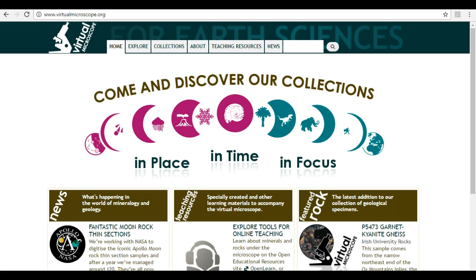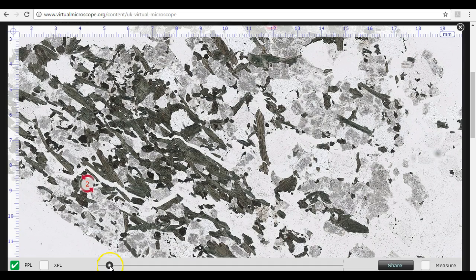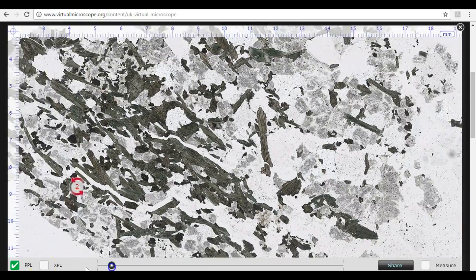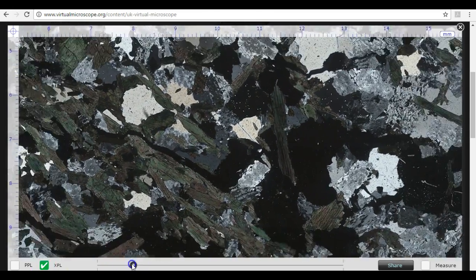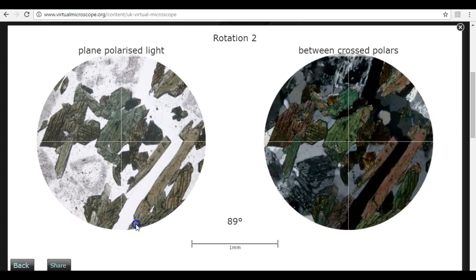The Virtual Microscope has been developed as a platform for geoscience academics to access geological samples without the facility of a petrography lab. The Virtual Microscope allows users to examine minerals and microscopic features in thin section, but also as hand specimens. Thin sections of rock are observed as an uploaded view through a specialized petrographic microscope without having to physically use a microscope.